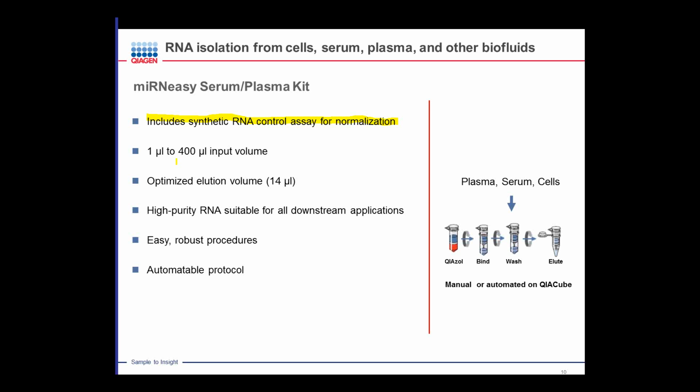So blood, or blood products, can often be collected in heparin. That, for example, is a very potent inhibitor of reverse transcriptase. It's good to know whether your samples are contaminated or not. And so this internal control will serve to monitor that.